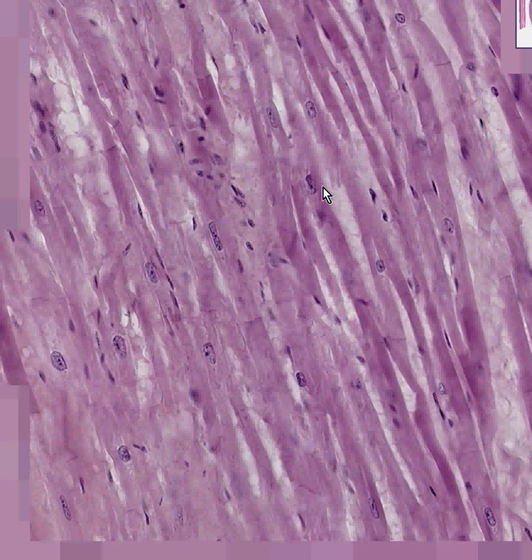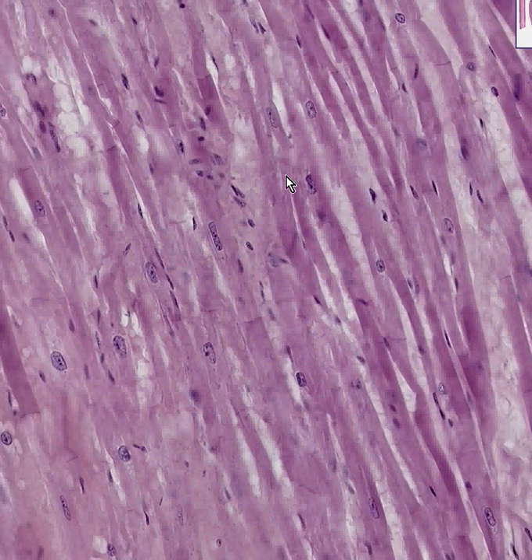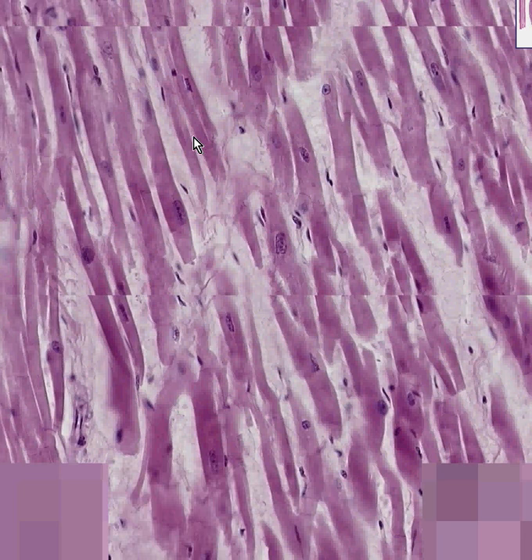Perhaps I could convince you that if you look very closely, like here, or perhaps here, or let's go to another place. If you can't see it well, just take a quick visit to another place. If you look perhaps here, hopefully I can convince you that these are striations also.